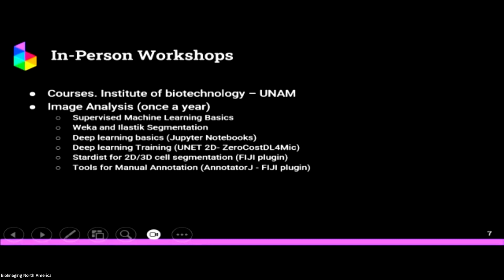Again, Jupyter notebooks, for me, are really, really useful. They allow me to code everything, and biologists or people who are not experienced with programming just need to click, click, click, and they obtain the results. Again, for segmentation, we have tools like StarDist. This is one topic really important for me. I try to teach the biologists that you only need to upload your image and you are going to obtain nice cell segmentation with StarDist, and then you can do all your analysis.